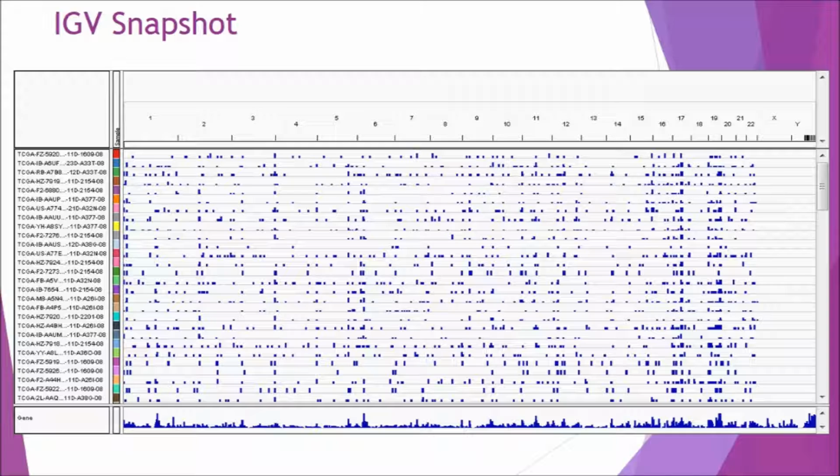And so if you look here, the blue dots show each specific mutation occurring within that sample. And so at the very bottom, you can see the total number of mutations in the entire sample and their locations. If you notice, towards the right, there's a lot more frequency of these mutations. So this actually creates a very visual look and aspect towards the study. And so this really helped me visualize the whole mutation concept and how frequently these mutations are occurring.